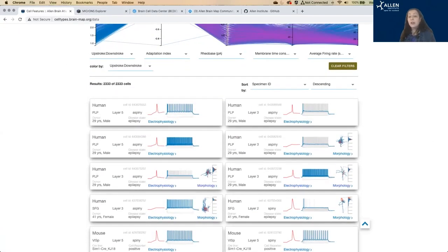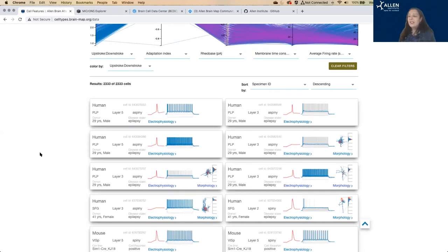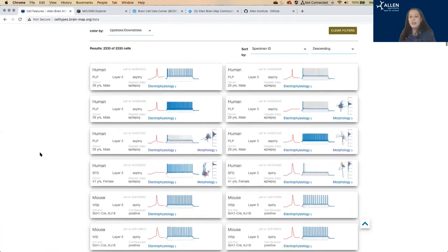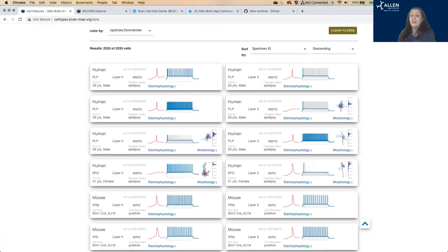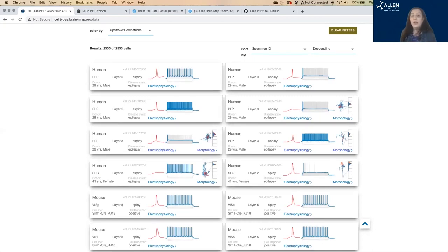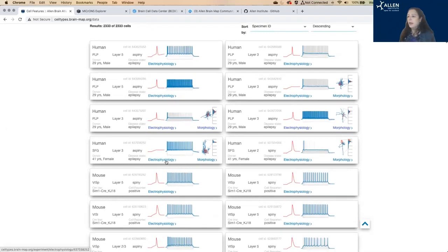So this is for a smaller number of cells than the transcriptomics data, where we have tens of thousands of individual cells. For this smaller number of cells, we are measuring their electrophysiological responses to some standard stimuli. That's patch clamp. And we create 3D reconstructions of some of those cells as well. So I'm just going to pick a random cell here.